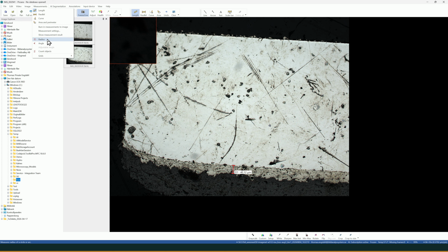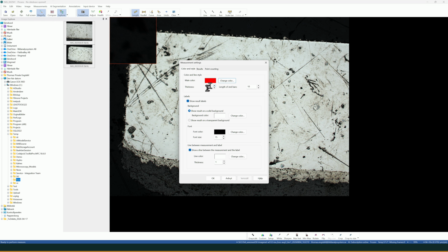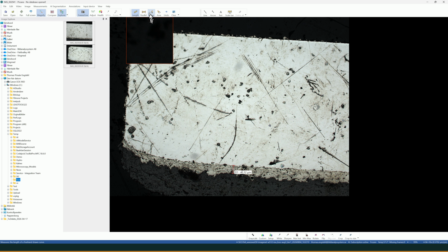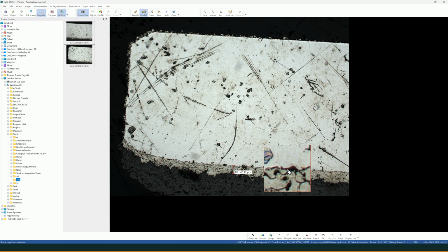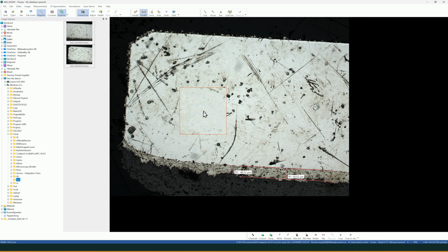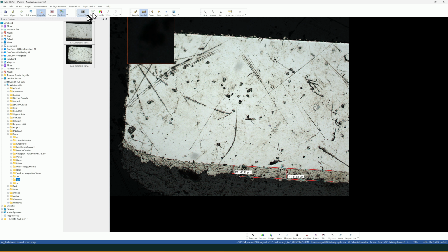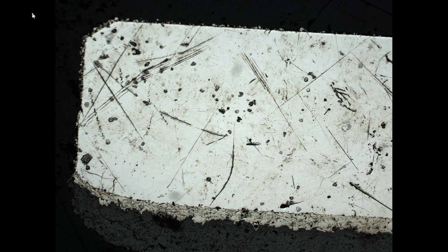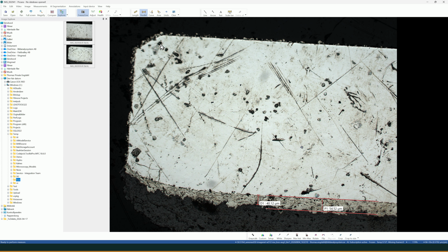Also, the measurement settings here, it was a little bit wide, I think, so I can make it a little bit thinner. So let's do it again, and this time let's use this tool. So I start from here to here with a magnifying glass. And yeah, there is also a full mode if you want to discuss the image with colleagues and you don't want to get disturbed by the user interface.